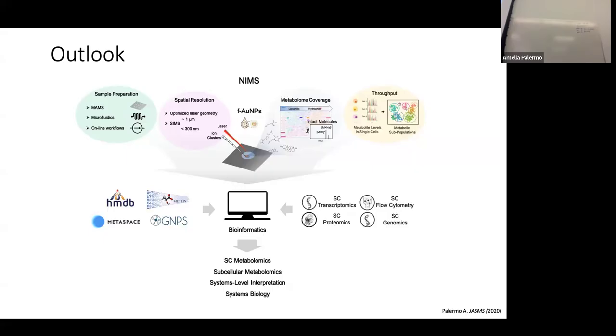you can have a preliminary annotation of your mass spec imaging data, but also they do have data sets from other studies in the world that have spatial resolution. So very often, if you're interested in seeing if there are data available acquired for your system, your experimental conditions, or similar, and you want to reanalyze them, then Metaspace is the database for those needs. And of course, this can be integrated with other omics.